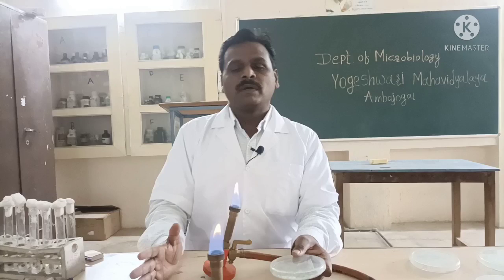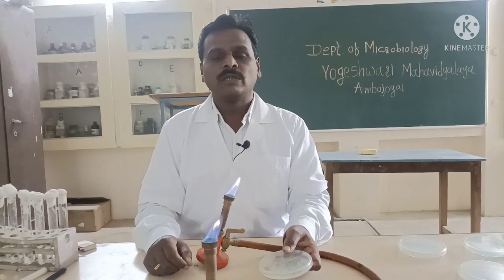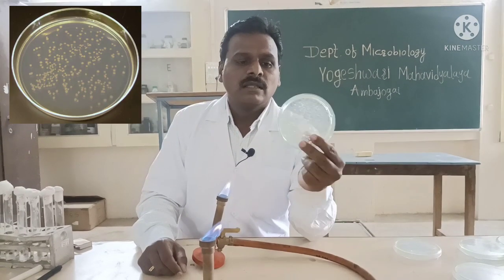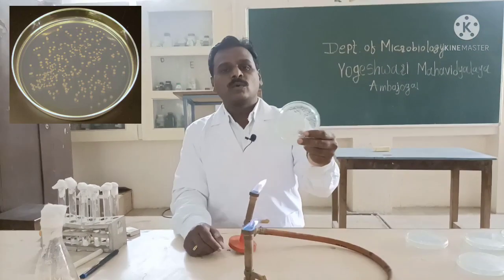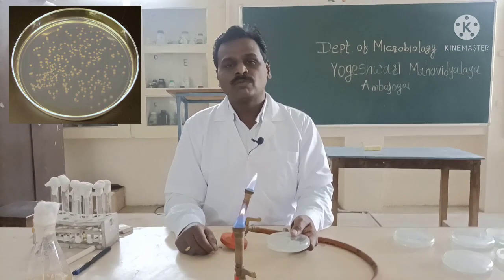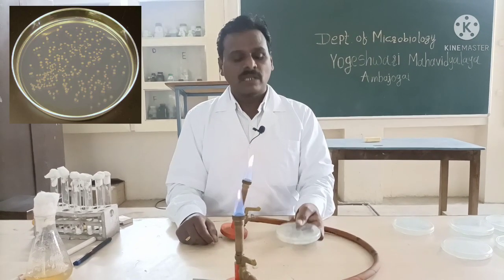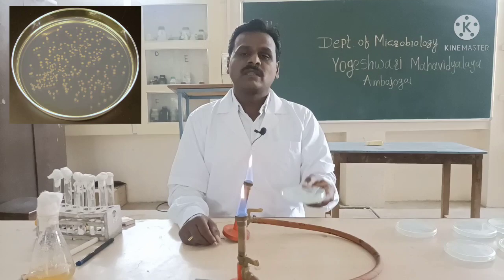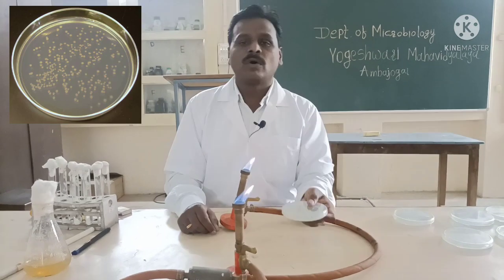After incubation we have to observe the colonies. Friends, we have prepared the pour plate — we kept the plate in inverted position for incubation at 37 degrees Celsius for 24 hours into the incubator — and then we have taken out the petri dish and we can see the colonies are formed on the plate. Then we have to count these colonies and we have to calculate the CFU per ml, that is colony forming units. So this pour plate method is also used for enumeration of microorganisms in the given sample. We have to select the plate which is containing 30 to 300 colonies, as that plate is suitable for counting only.